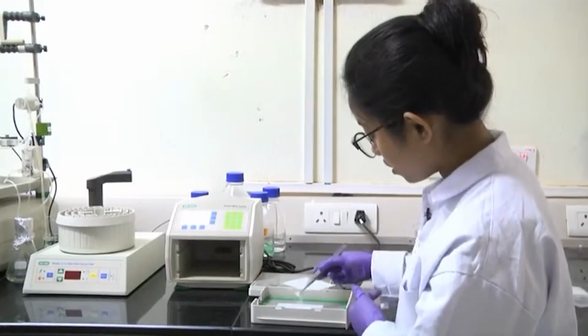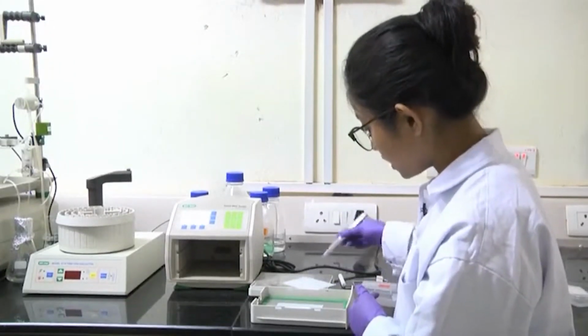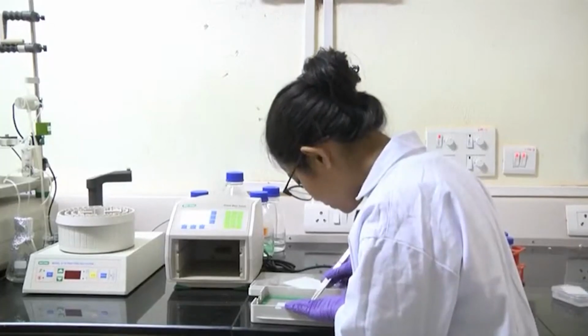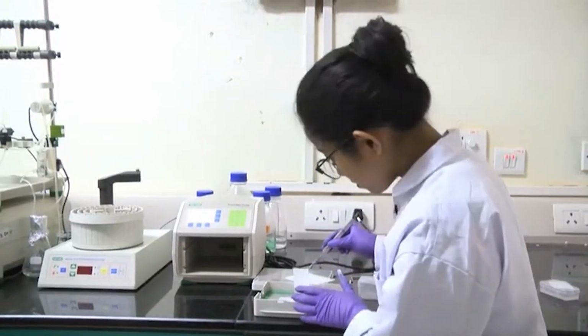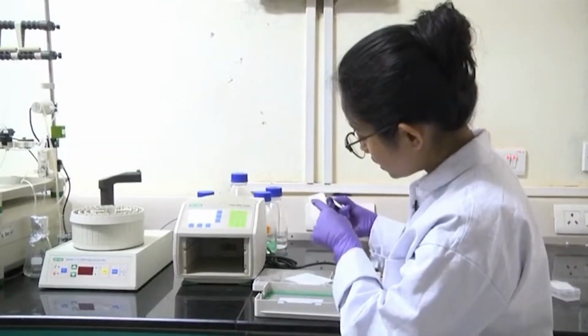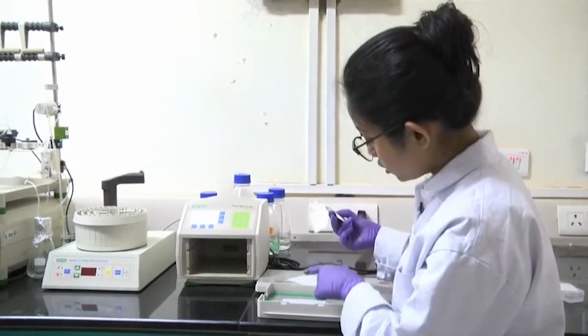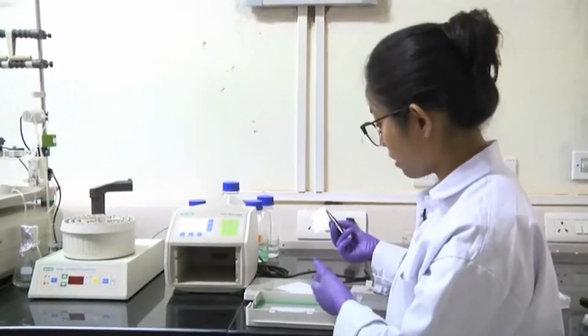As I mentioned or showed, it was a pre-stained marker. So, in the gel there is nothing. But in the membrane you can see there is a portion where the ladder is present. So, basically the protein has been transferred from the gel to the membrane.